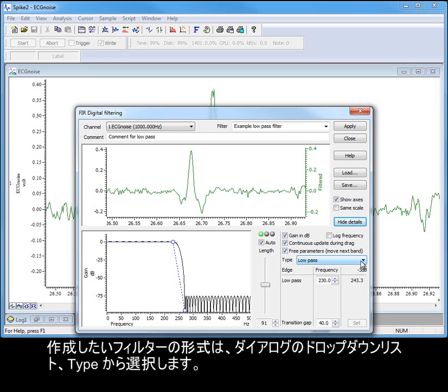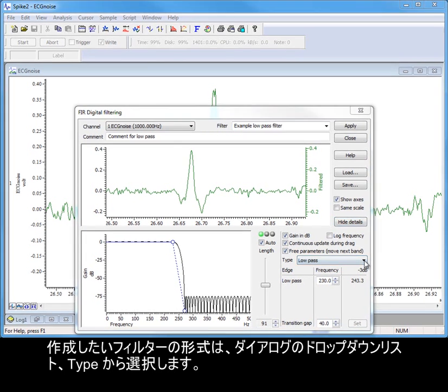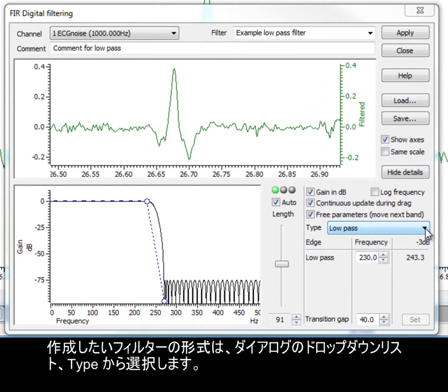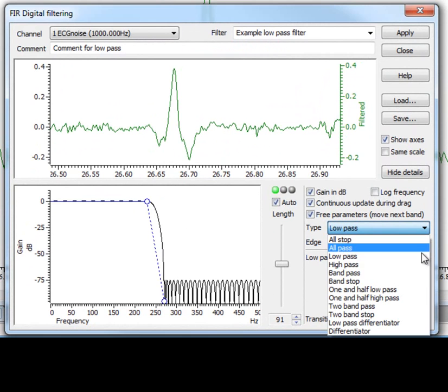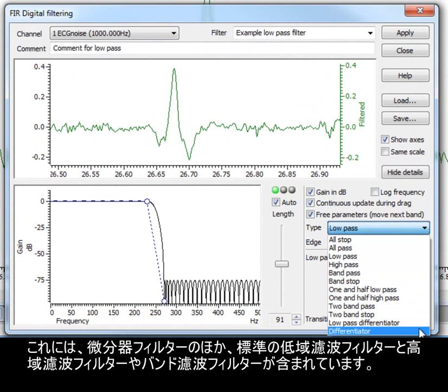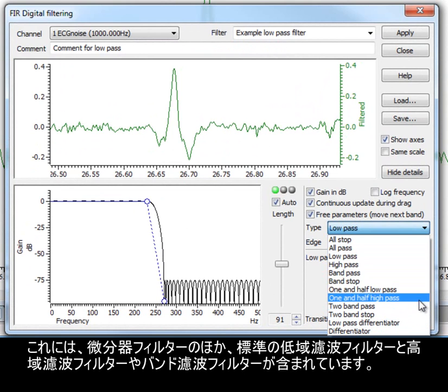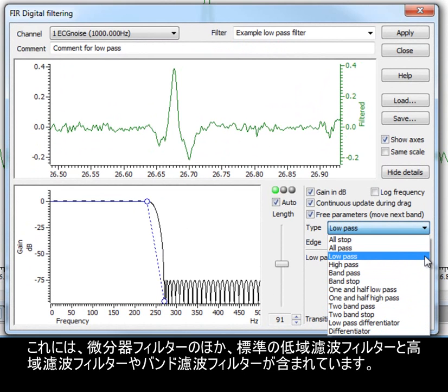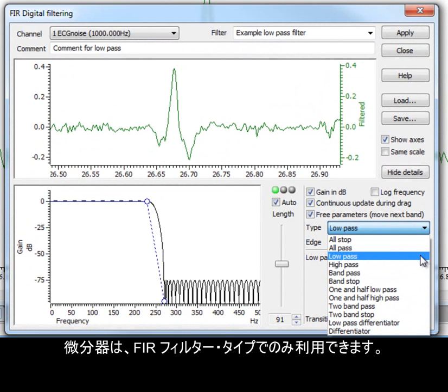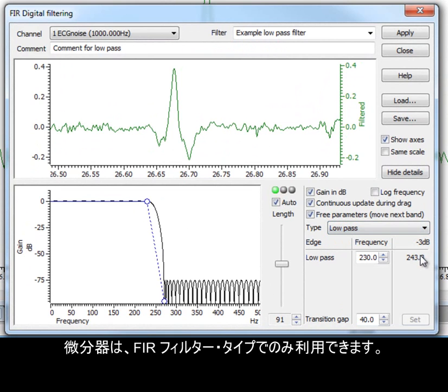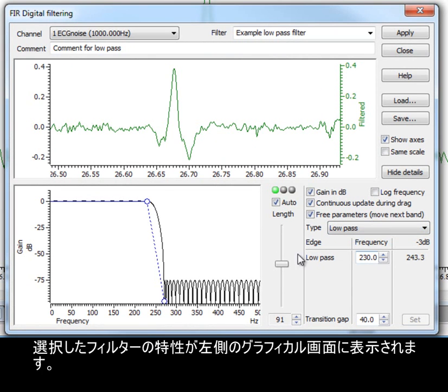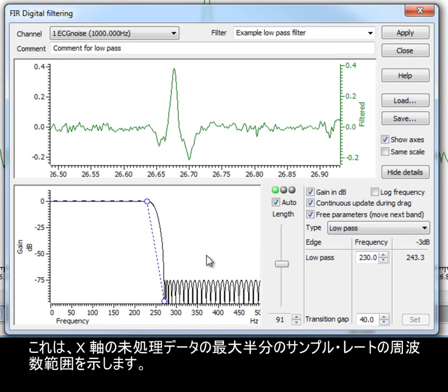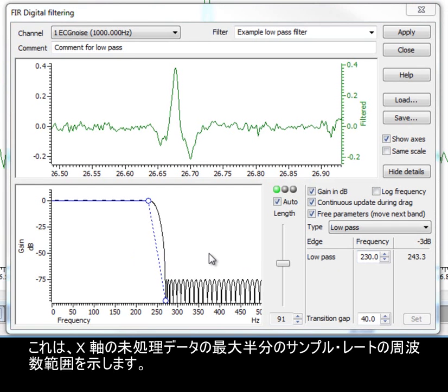The style of filter you want to create is selected from the drop-down Type list in the dialogue. This includes differentiator filters, as well as the standard low and high pass and bandpass filters. Differentiators are only made available for FIR filter types. The characteristics of your chosen filter are shown in the graphical display on the left-hand side. This shows the frequency range up to half the sample rate of the raw data on the x-axis.